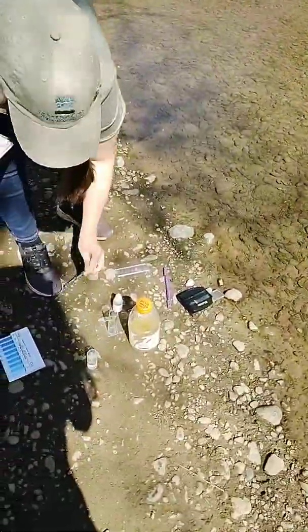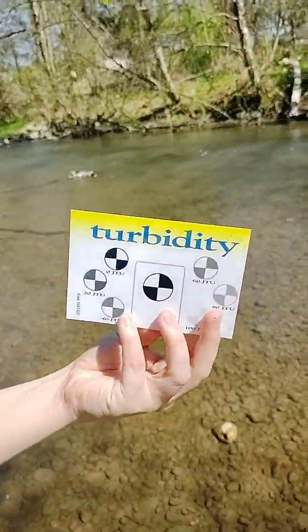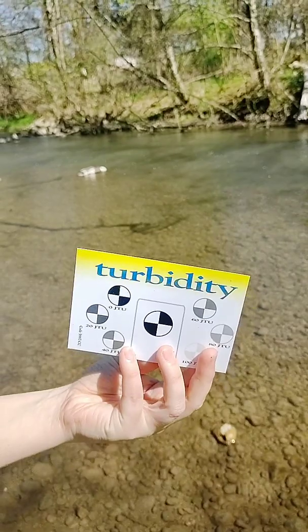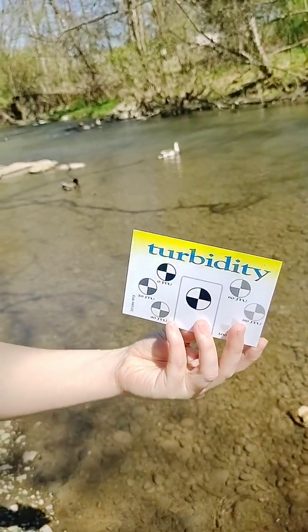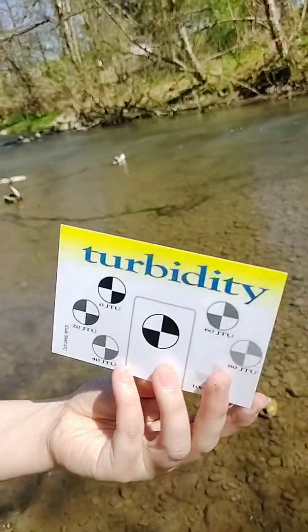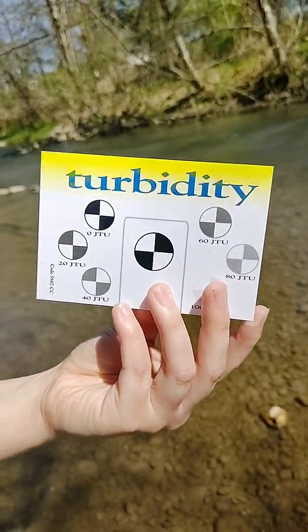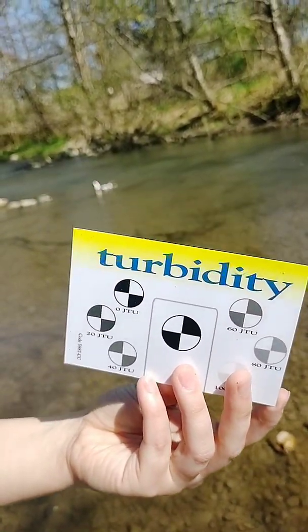And so we're going to be using this Secchi disc card. So turbidity is the measure of suspended sediment in the water. Some implications of too much turbidity can be that it can gunk up salmon gills if there's too much sediment in the water. Also, the sediments can absorb sunlight and make the body of water hotter. And also sediments can build up over time and just block water passages in general. So that's kind of why we're looking at turbidity here.